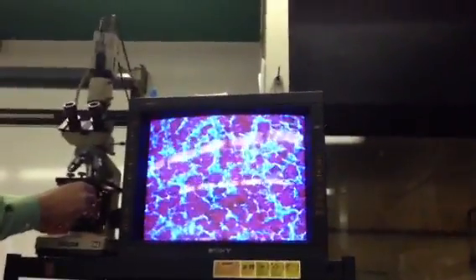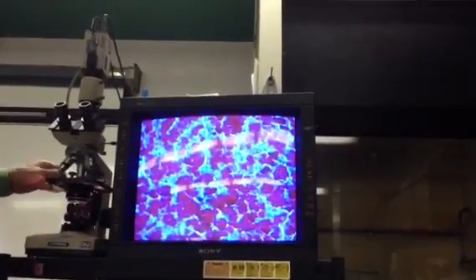if I do it, I will always give you some context, which means I'm not just going to show you anterior, I will also show you like maybe a region like this, although these blood vessels kind of get in the way a little bit. But, you know, there's a little more of a field in the microscopes than there is on the video screen. But what I would do is I would show you some context here. And also, you're not going to see any kind of red like this.